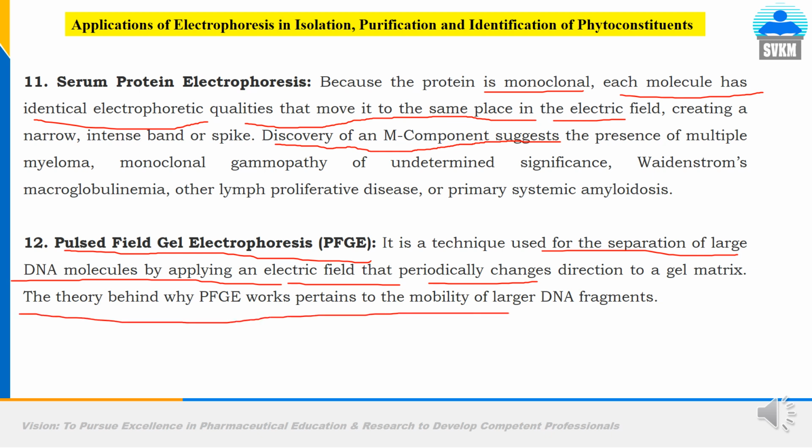Because of this pulsed electric field, you get proper separation of large DNA molecules of plants as well as of the human genome, and thereby it gives a proper separation of proteins, nucleic acids, and DNA.